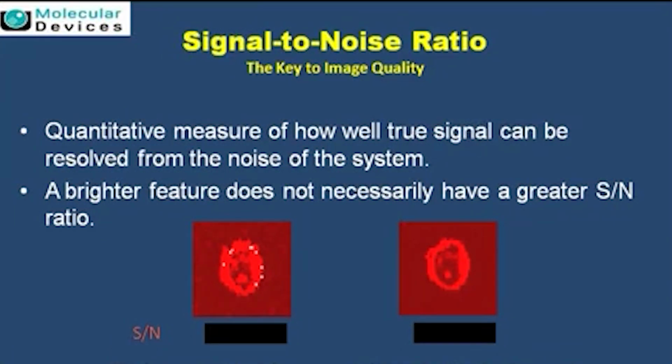So one needs to definitely adjust the signal to noise ratio to achieve very good image quality, and obviously simultaneously perform the PMT adjustment as well as other parameters. True. As you go for the signal corrections, basically you're trying to follow the same thumb rules of not looking at saturations, and then you expect the image is going to have the least background, so the valid information which is coming in the form of intensities becomes a true signal.